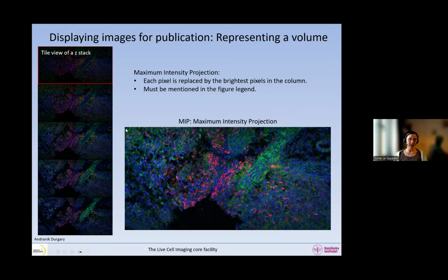And what we do is that for each, so we go, let's say, to the first pixel in the software, and then look at the column of pixels, so the same pixel in all the images, but changing in Z. And we'll pick the brightest pixel in the column and keep that intensity for the maximum intensity projection. And same thing for each column of pixels, we are keeping the brightest intensity. So then at the end, we have a single image that has lost its Z information, but it shows you pretty much all the Z as if your sample was transparent and you were looking from the top. So that works very nicely.